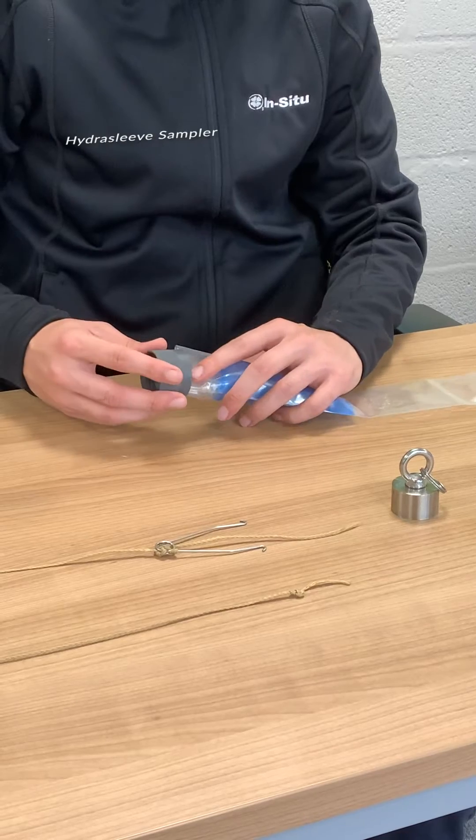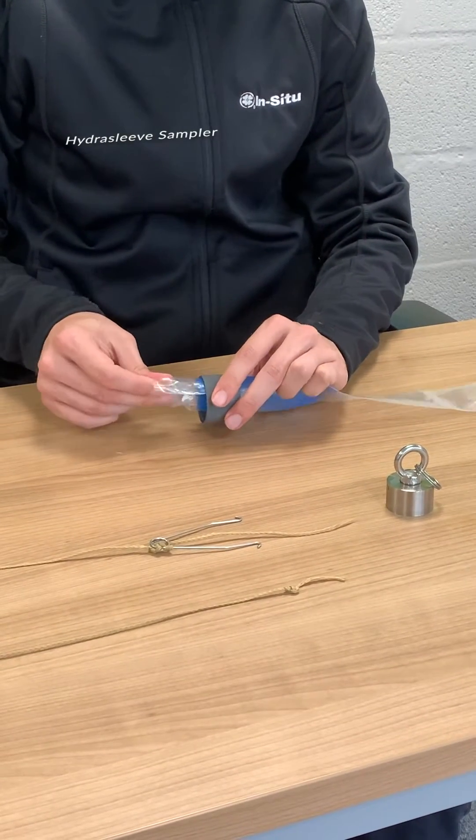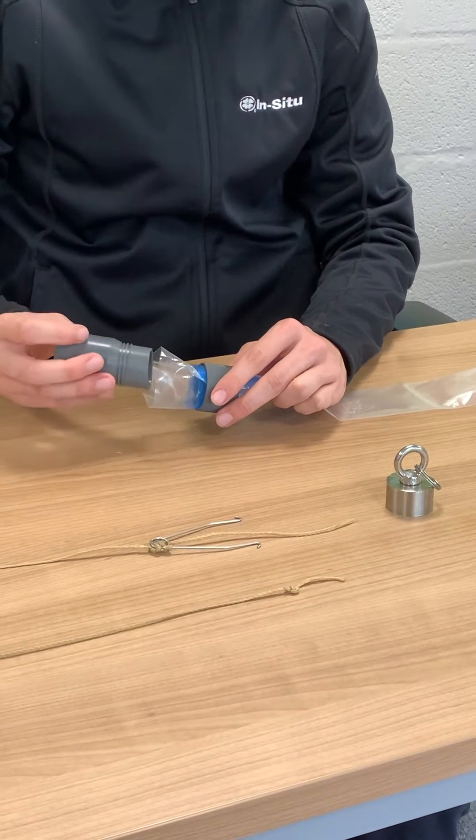Let's take a look at two of the most common no purge samplers. Hydra Sleeves are a grab bag style sampler. You have a disposable polyethylene bag with a reed valve at the top.